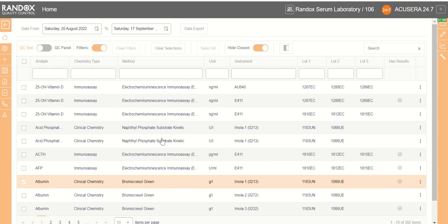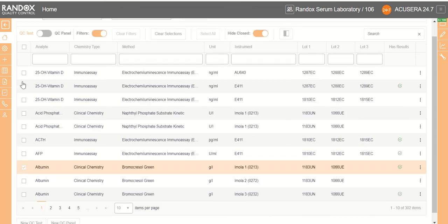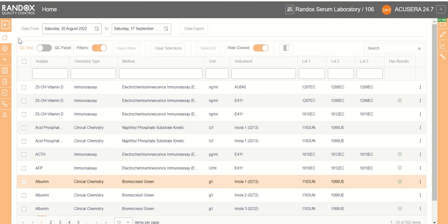You will also be requested to change your password. This is to allow for unique access and for security reasons. And that concludes the logging in portion of the Randox AccuSera 24x7 training series.